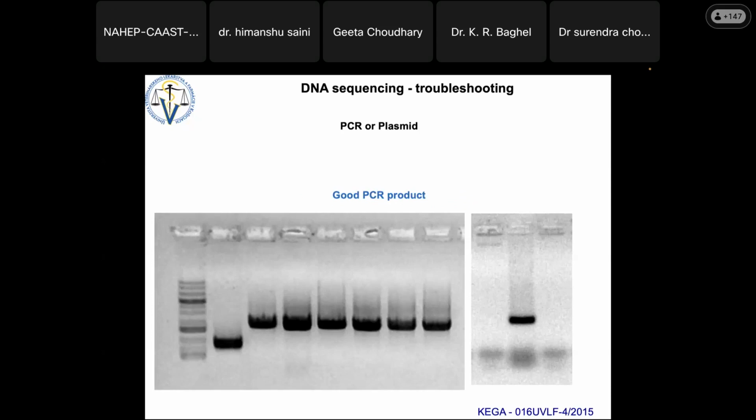Okay, now which gel system and which dye system do you use? SYBR Green or ethidium bromide? Really? All ethidium bromide and UV? Crazy.